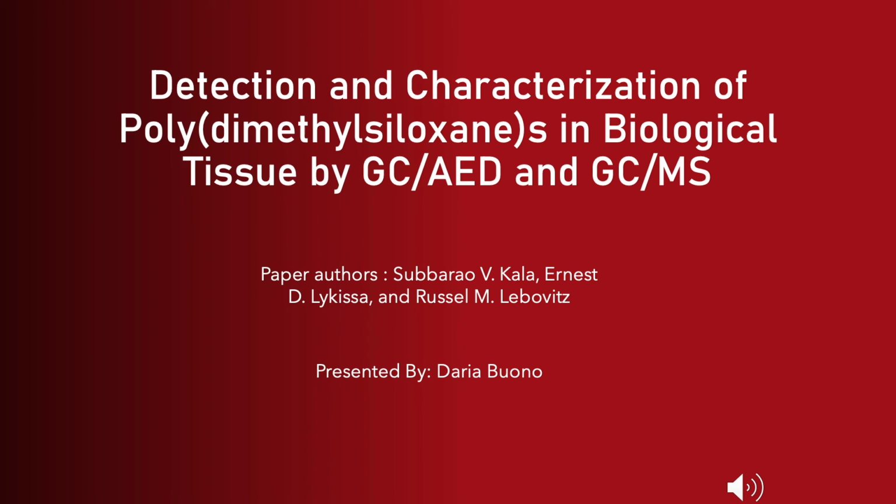Hi, my name is Daria, and I did my presentation on the paper called Detection and Characterization of Polydimethylsiloxanes in Biological Tissues by GC, AED, and GC-MS.